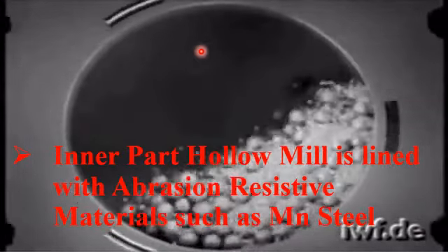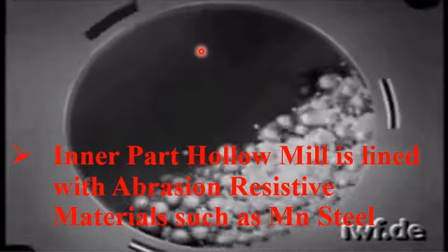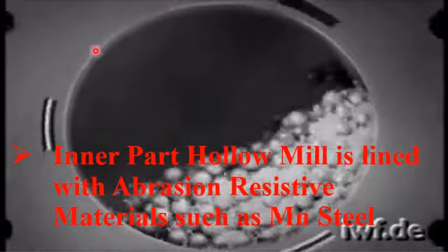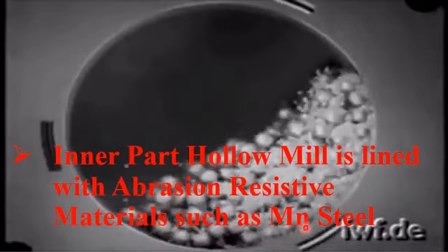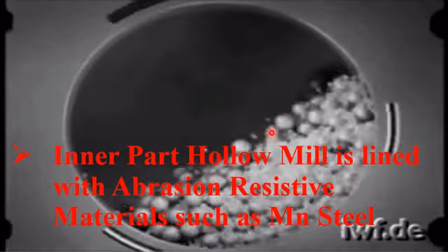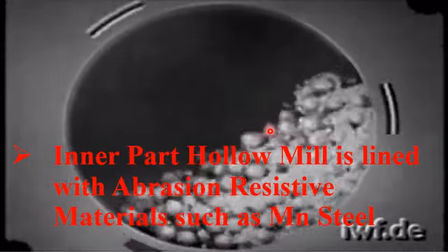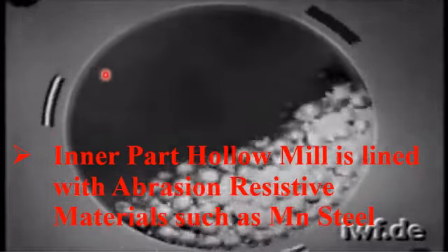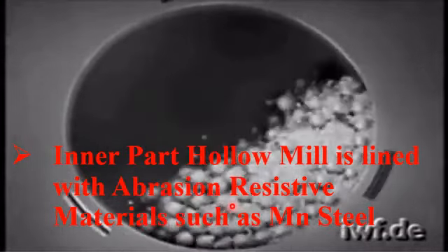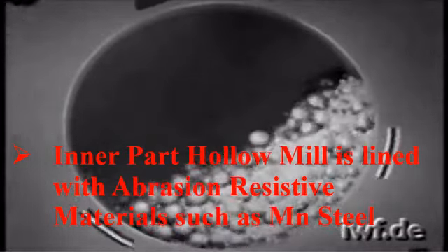So these are the three essential components of the ball milling apparatus. The first is the drum of the ball milling apparatus. The second one is the balls present in the ball milling apparatus, and the nature of the balls. And the third one is the abrasion resistive coating of the ball milling drum from inside.